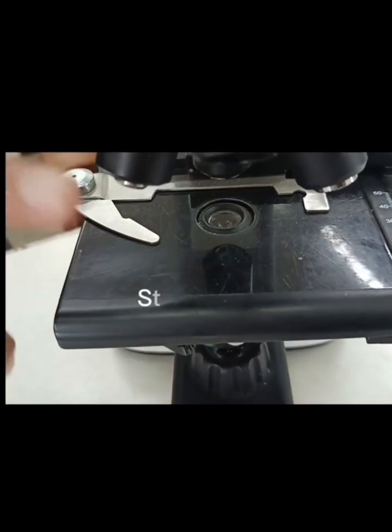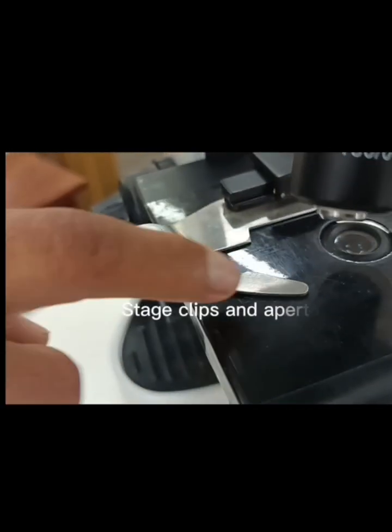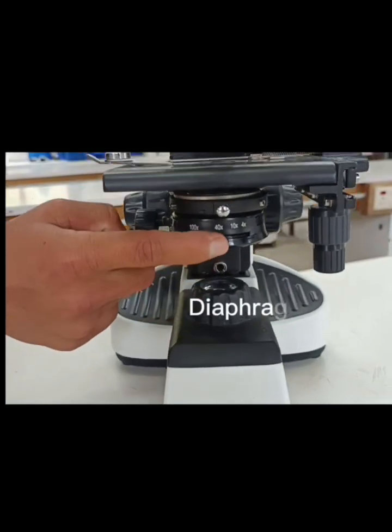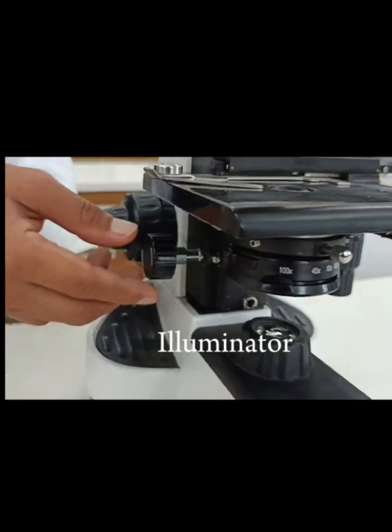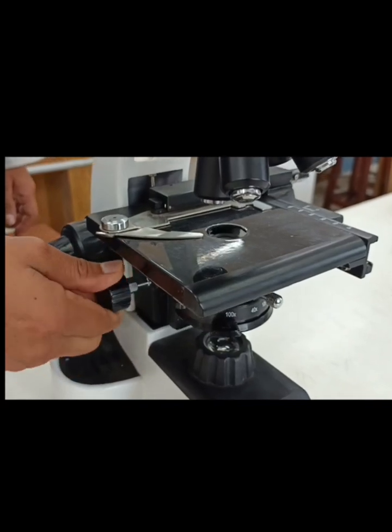Now this is a stage. This stage consists of a stage clip and aperture. So below the stage, it consists of diaphragm. Below diaphragm lies the illuminator, and this is the knob that helps to adjust the aperture in the stage.